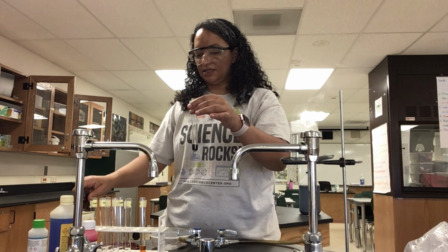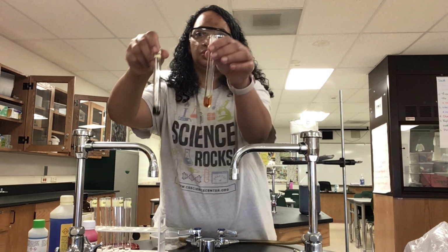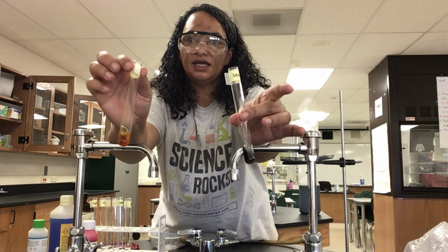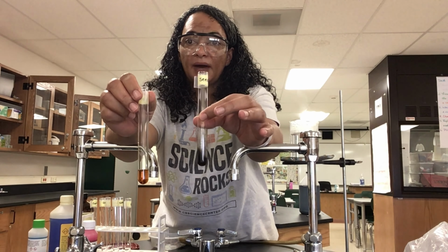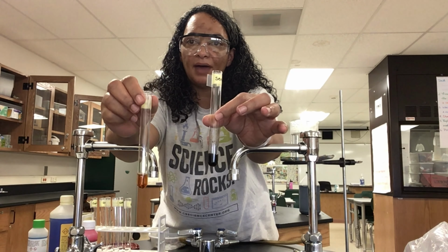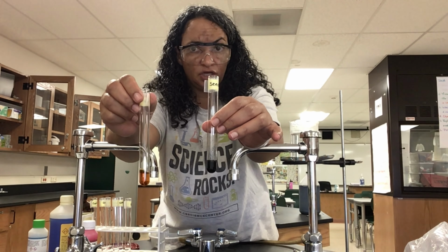And what the heck is going on here? All right, so if we look at our control versus our seed, so let me put it, seed is in this hand, control is here. So the control has no seed, it stayed at light brown color. Over here, my seed turned a nice dark black. All right, so what does that tell me about whether or not my seed has starch? Let's talk about that.